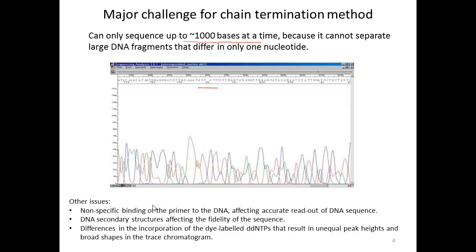Now, one of the clever things that was done in interpreting this data is that each base call was assigned a quality score, and from that quality score you could derive a probability on how likely that call is to be correct. So then when you're assembling the sequence or putting it all together, you know which sequences you can trust very highly and which ones would be more problematic.